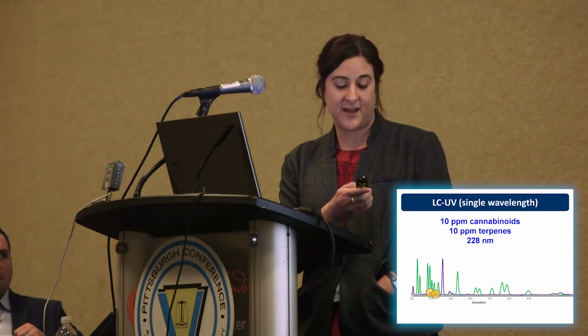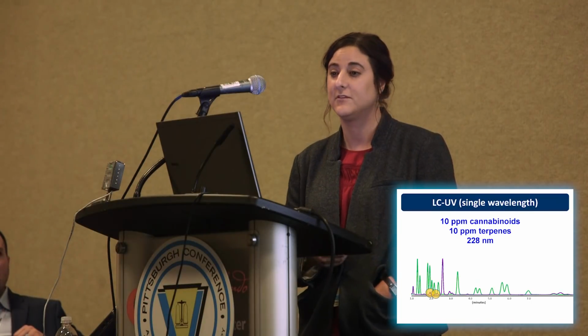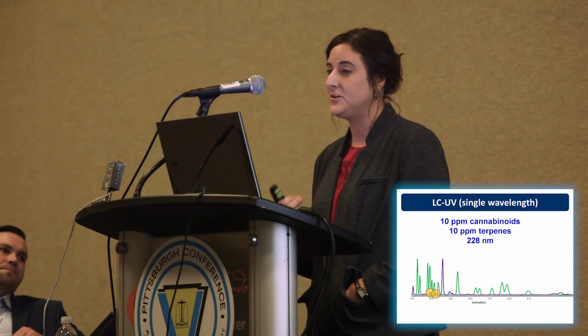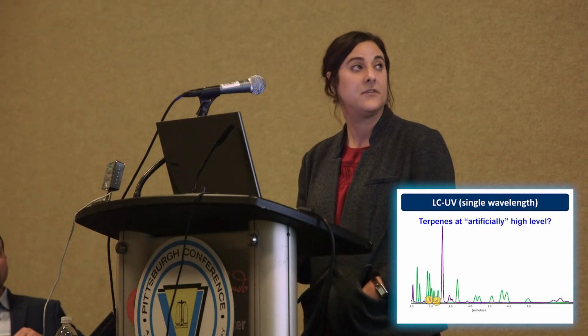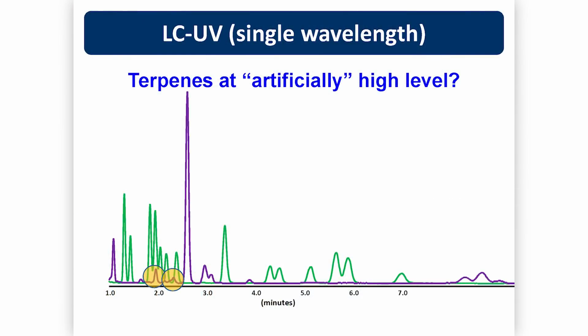You will see down here that there are some terpenes that are causing an issue. Again, the argument from people that have been aware of this is that terpenes are naturally very low abundance. The issue is, again, people are adding terpenes back in. So that's not the case anymore. So obviously, these signals are much more disruptive now.